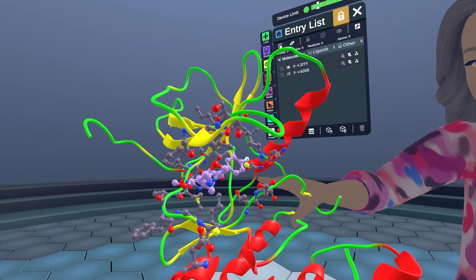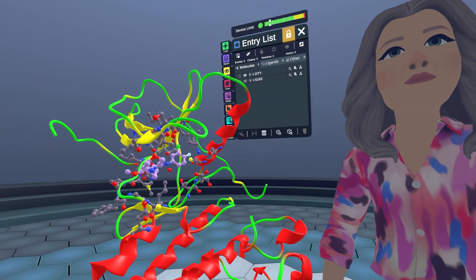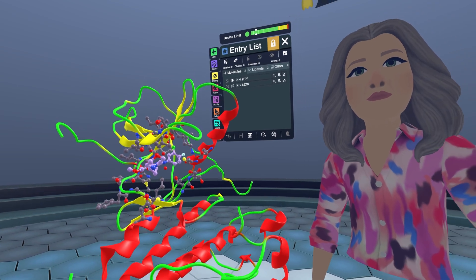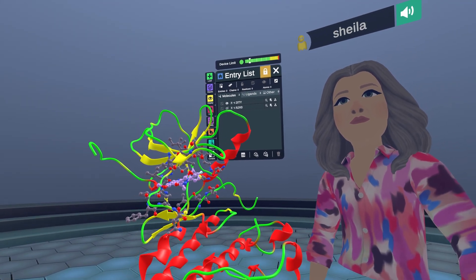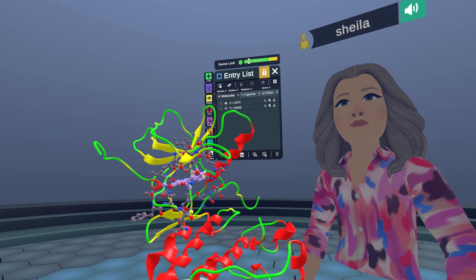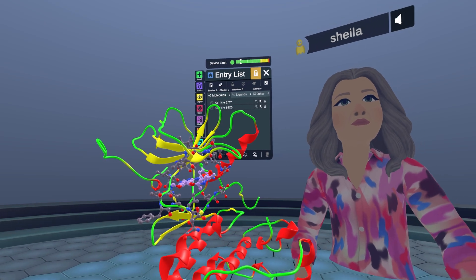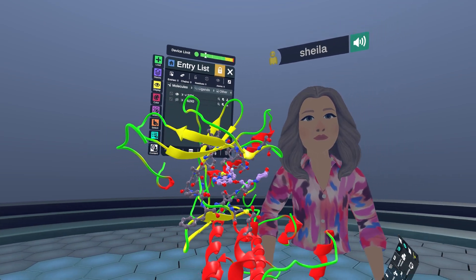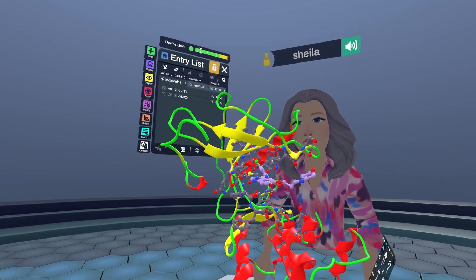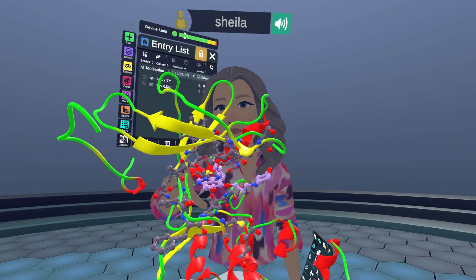This threonine gatekeeper residue is important as the mutation to methionine at that position leads to gefitinib resistance in multiple cancers. We're going to model this mutation in Nanome. First, we need to find threonine 790.